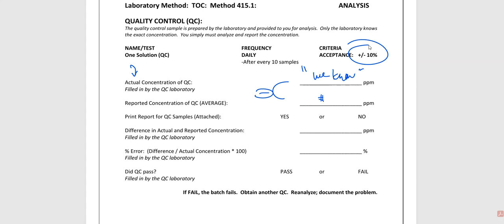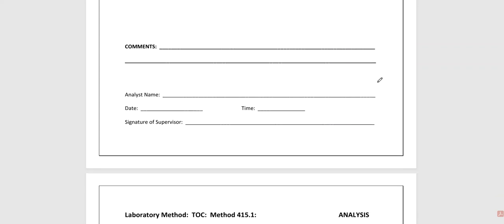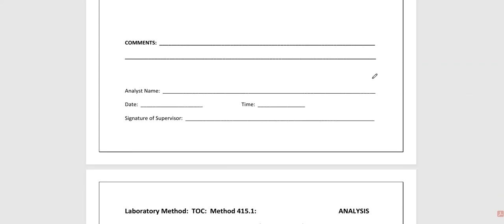Did the QC pass? Yes or no? As before, write any comments, statements that you want to include. Sign, date it, time it. Let someone look over it, making sure you did the calculations the right way. And then that now is complete.